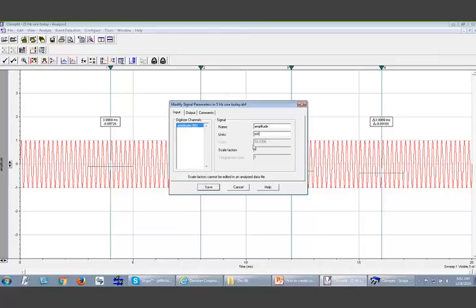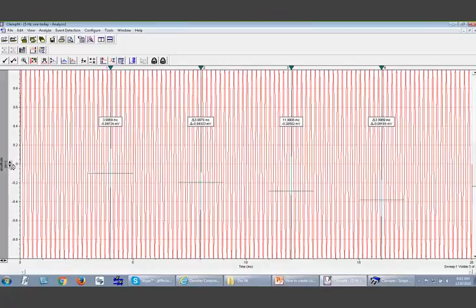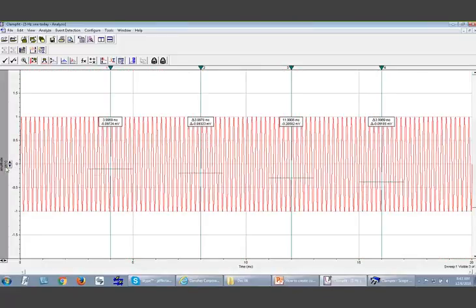All right. You can, of course, put current in picoamperes if you want to inject current. Then hit save. Now you can see here it's in millivolts. All right. Now what you need to do is create your own waveform.